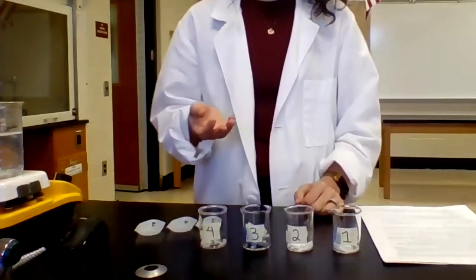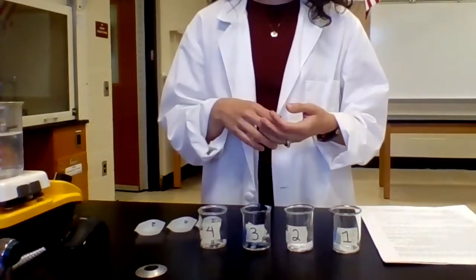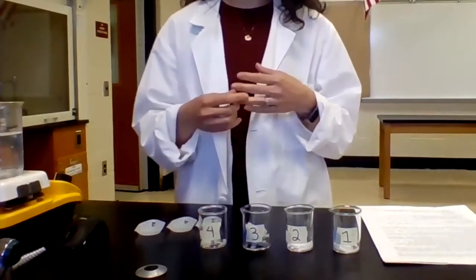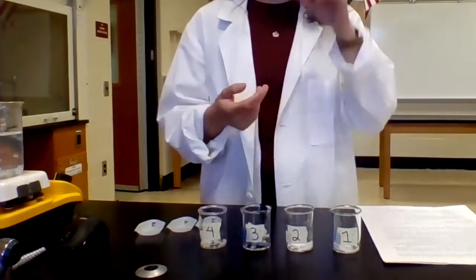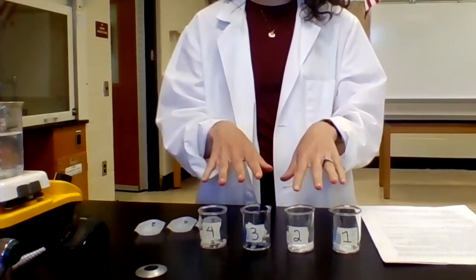So in this experiment, what we're going to do is look at 12 different solids, examine their physical properties, and see if they are metallic, ionic, nonpolar covalent, or polar covalent. For this video, I have 4 of those solids shown.